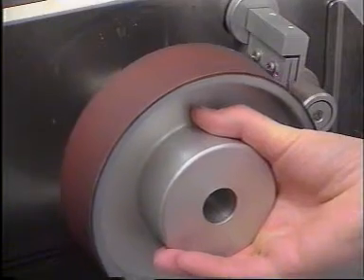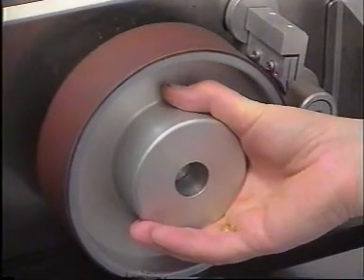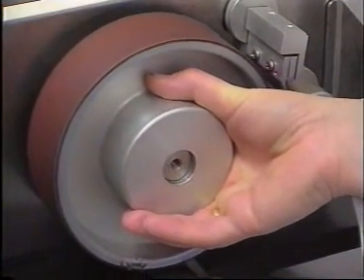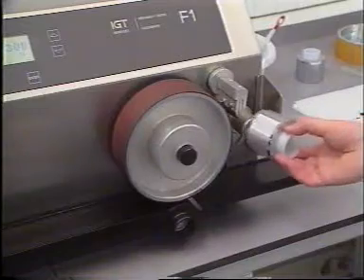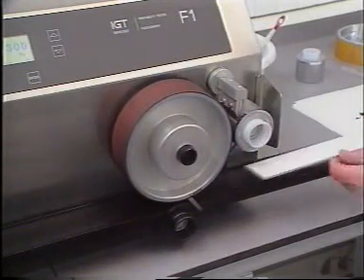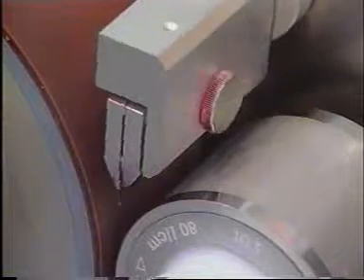It is important that a print can be made which resembles actual practice in density and printing quality. The inking and printing force settings depend upon the nature of the printing form, the ink and the substrate.